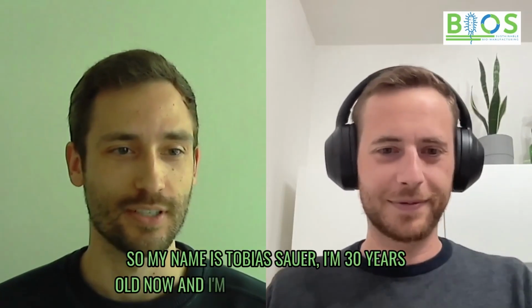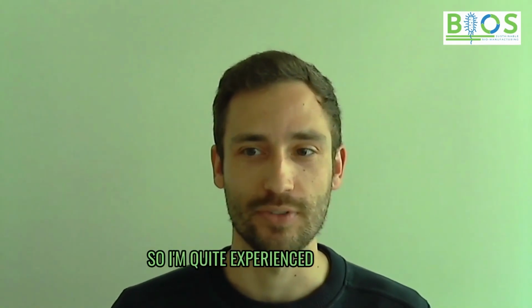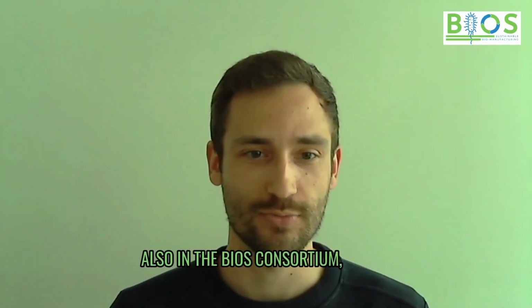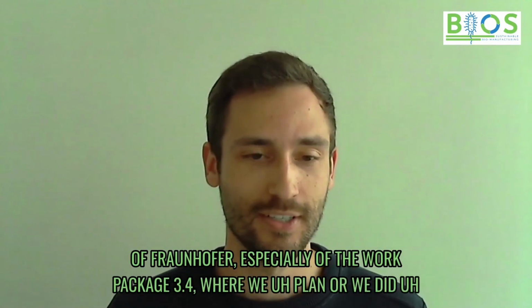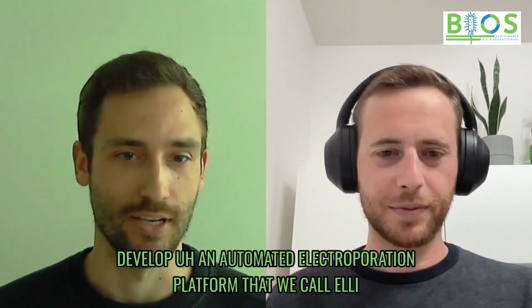Yeah, for sure. So my name is Tobias Sauer. I'm 30 years old now, and I'm an automation engineer by training. I'm here with Fraunhofer for like 5 years now. So I'm quite experienced as a development engineer for lab automation devices. We do everything from small devices, technology development, up to bigger production plants for pharmaceutical or medical purposes. And also in the BIOS consortium, I'm the project lead of Fraunhofer, especially of work package 3.4, where we planned and already developed an automated electroporation platform that we call ELLI.